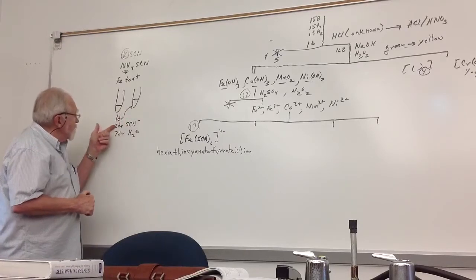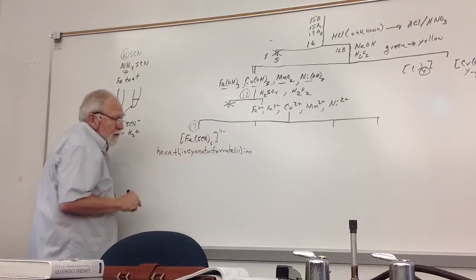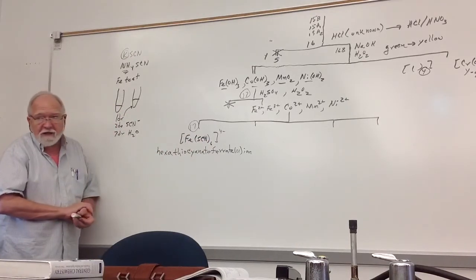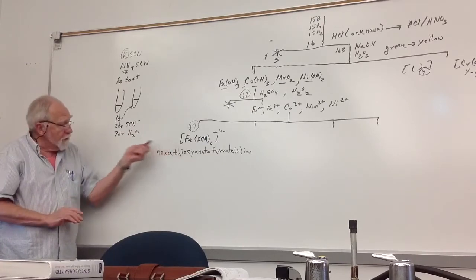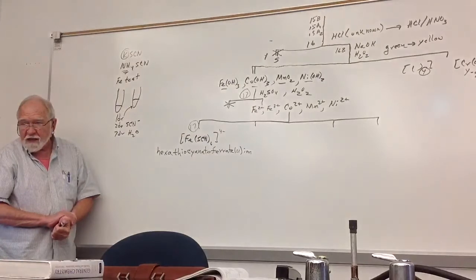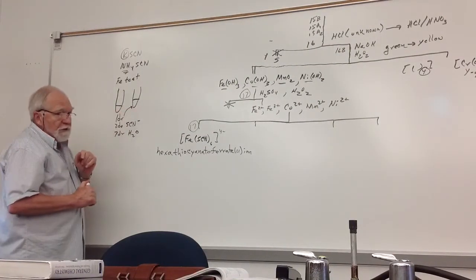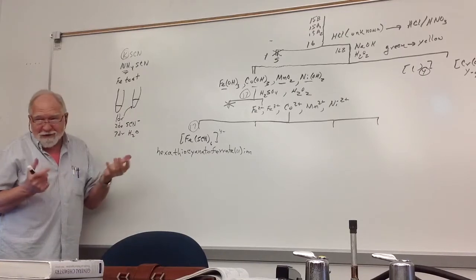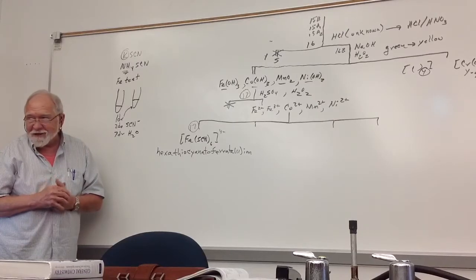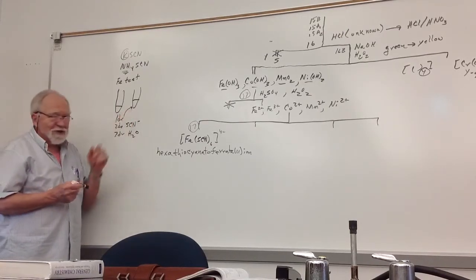And the reason you add the extra 2 drops is to keep the equilibrium shifted towards this thing. Dilute things out, they start breaking down just because of the equilibrium shifting it back towards the reactant side. You reduce the concentration of the thiocyanate. Okay? So I want to see both of these test tubes when you come up, and usually that's the big delay. People come up with their test tubes, they want to take their quiz, they want to get their unknown and get started, and I make them go back to the locker and prepare the dilution.